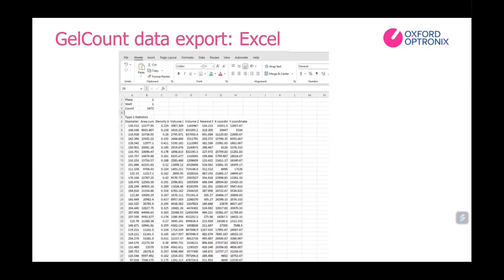Now, what I think is even more important and maybe more useful to some researchers is you actually have access to the full data from each and every counted object in a respective well or dish. So here we're looking at one well from that example that we just looked at. So this is well 1. And just so you can follow along, each line of this Excel sheet is the individual information of one counted organoid.